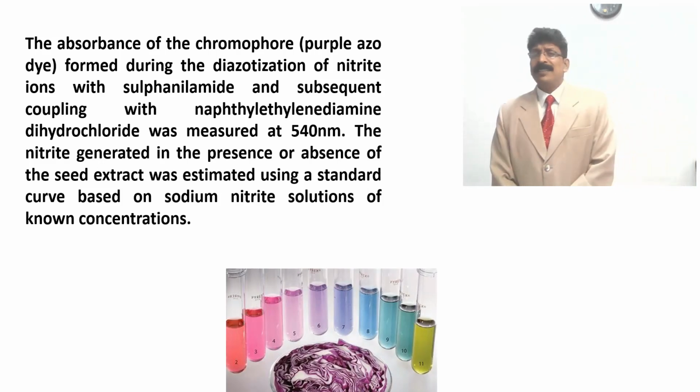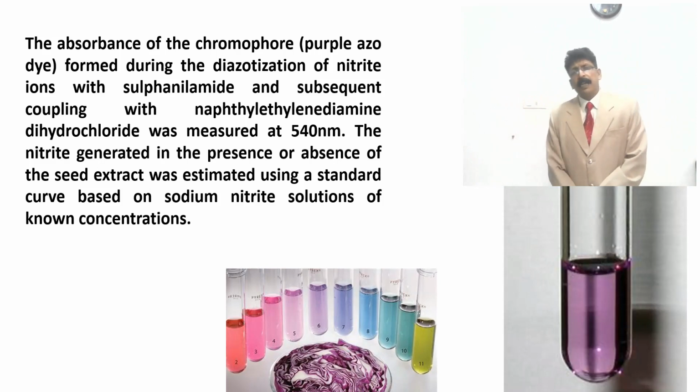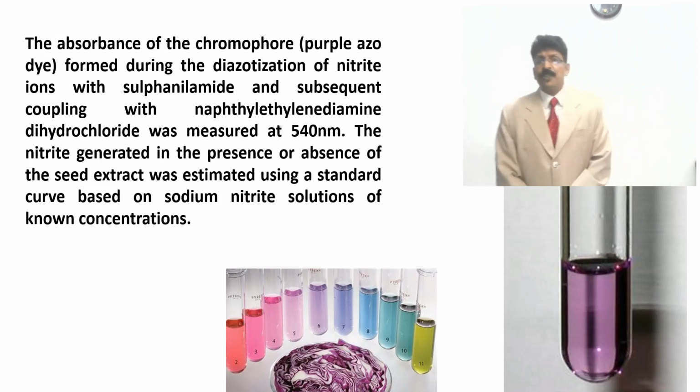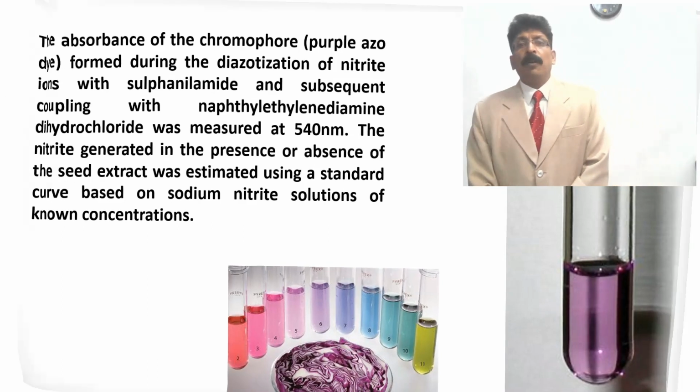So this is just a picture to show you of a purple color. Sometimes the color may be different according to the reagents which you prepared and used and the sample extracts which you have applied.